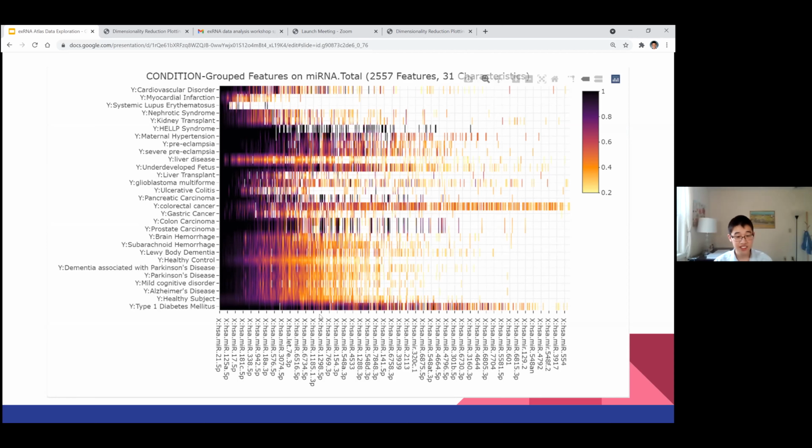And each of these microRNAs constitutes a bar, and the amount of that microRNA is denoted by the color. So you can see there's a group of microRNAs that seem to be present in practically every tissue, and then there's a bunch that are more tissue specific, and some are barely present in any tissue, like the ones at the end.